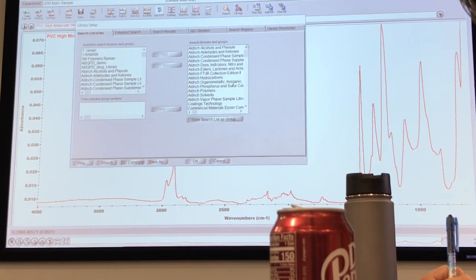If you were a failure analysis lab, you would use it very often, because you may find that one particle and you will be like, oh, what is this? I don't have this in my library. Then at that point, you definitely want to go to FTIRsearch.com and search against there. So that is a pay-as-you-go site. So it's like you find that spectrum that you have to match or find a kind of match for, that's when you will use it.